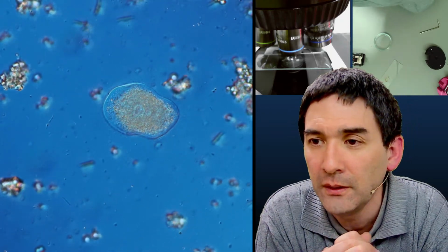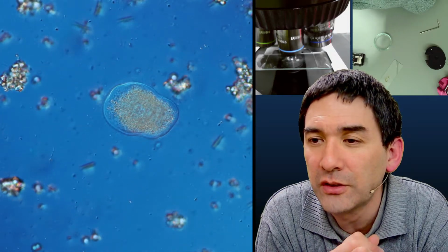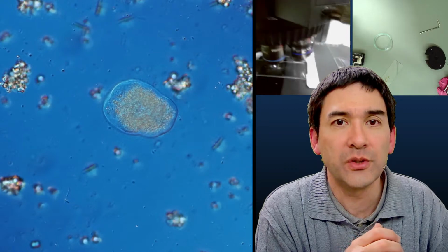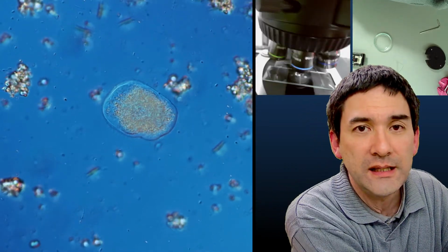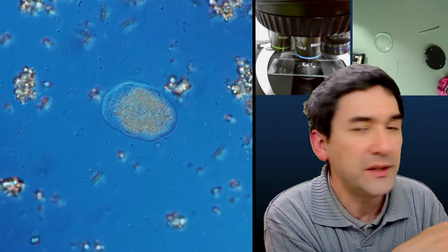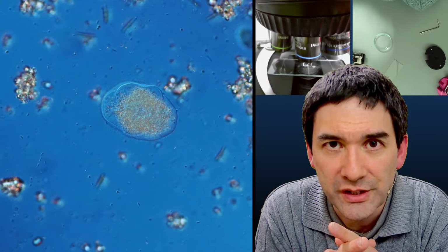Do you insert your slider prism all the way or partially into the slot as part of the adjustment technique for background color? Okay. The slider that I have here that I was turning is inserted all the time. And this is actually one of the reasons why I like this microscope so much, because this slider at the top, which I was just turning, works for all magnifications.